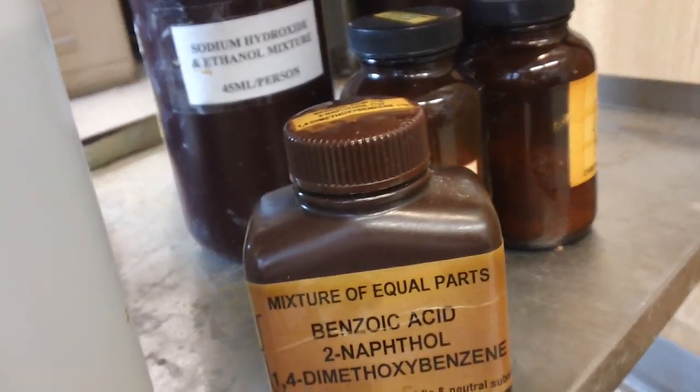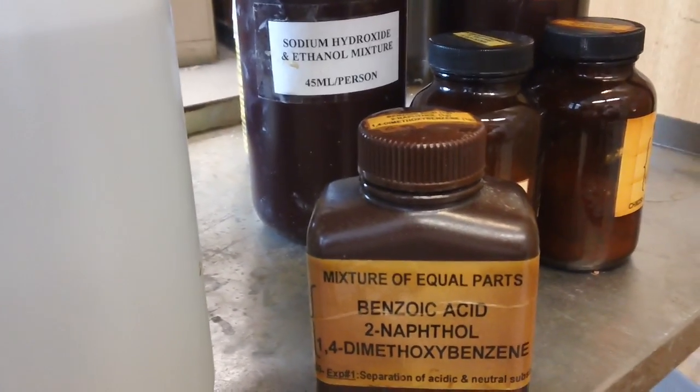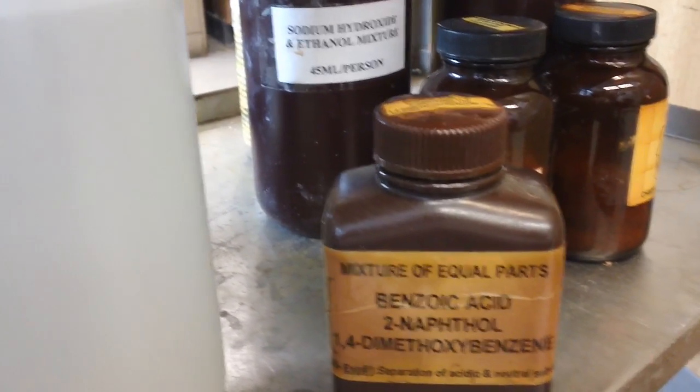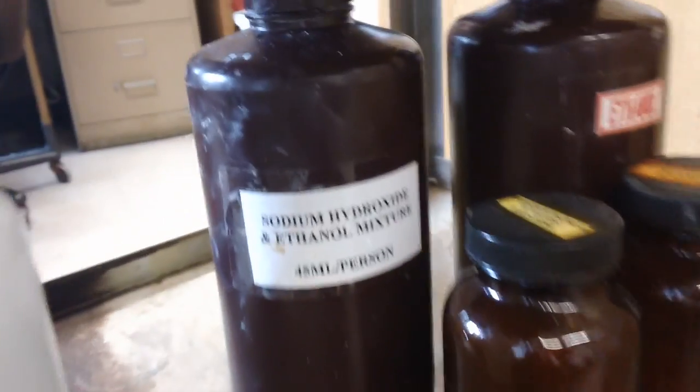You have to treat it — treat each one separately inside of three beakers. So when it's treated, you treat it with sodium hydroxide and sodium bicarbonate.